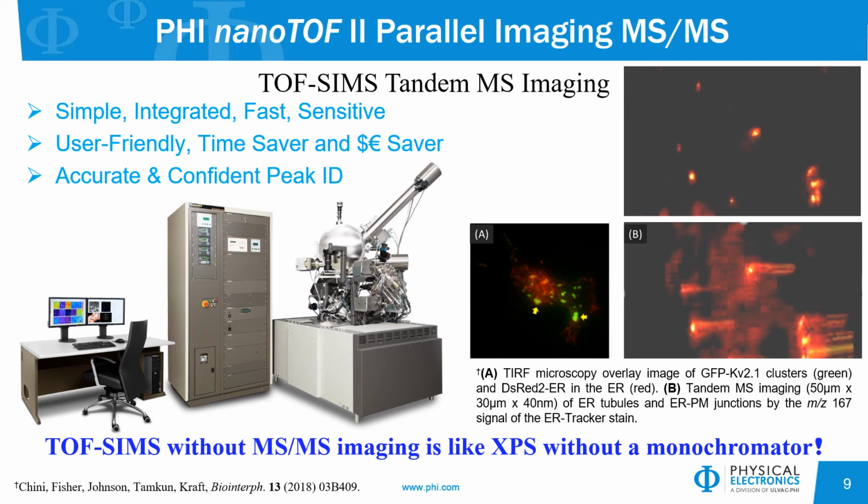So we've shown today, in conclusion, a new application area of using TOF-SIMS tandem MS imaging analysis for characterization and peak identification of monolayer films. In this particular case, looking at small organic molecules condensed onto an inorganic surface.